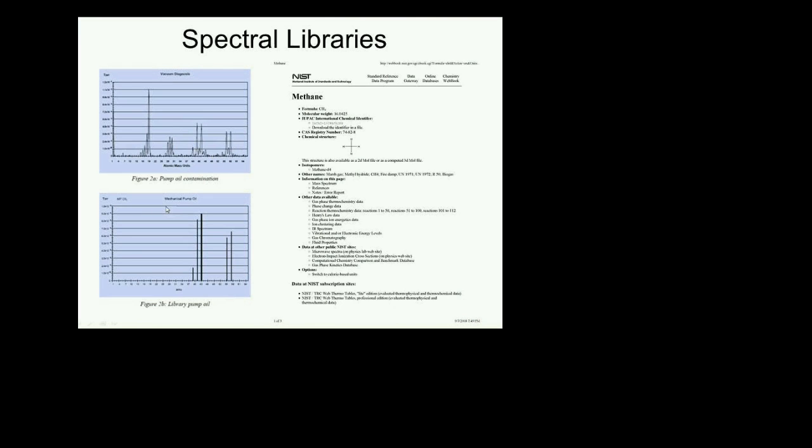And I could have done something similar going here, right, except that I would have done a lot more hits. But there's more than one way to do spectral identification. There are lots of tables out there that you can use, and this is a good one with a lot of different species that people use in their vacuum system. So I hope that this gave you a spectral identification 101 methodology.